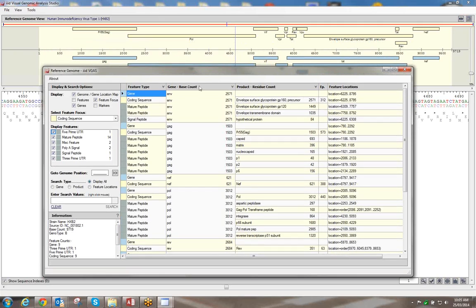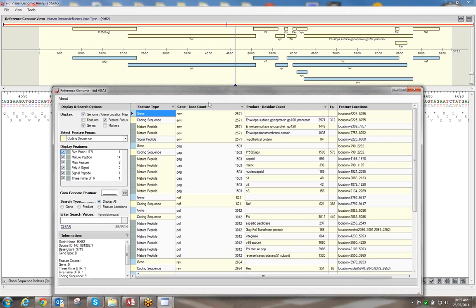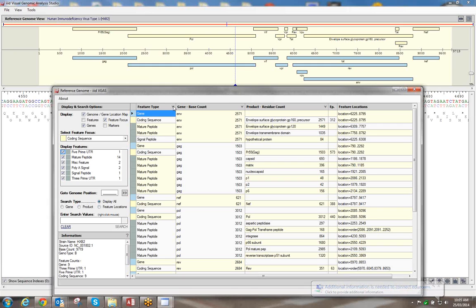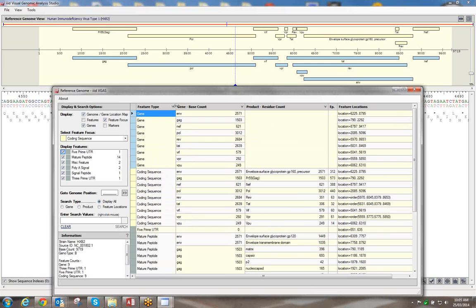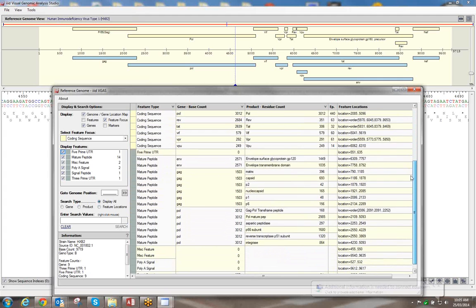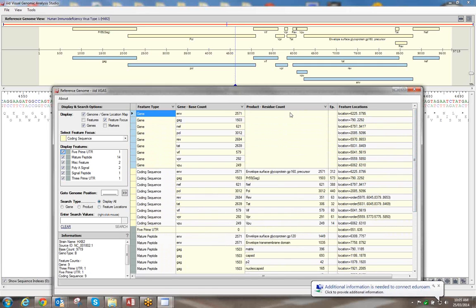You've got a list of feature types: genes, coding sequences, mature peptides, signal peptides — these are just different annotations for different sequences. You can see ENV, the envelope protein, GAG, and POL, which is the polymerase. The panel with the blue represents the genes, and the ones above it are the coded sequences.